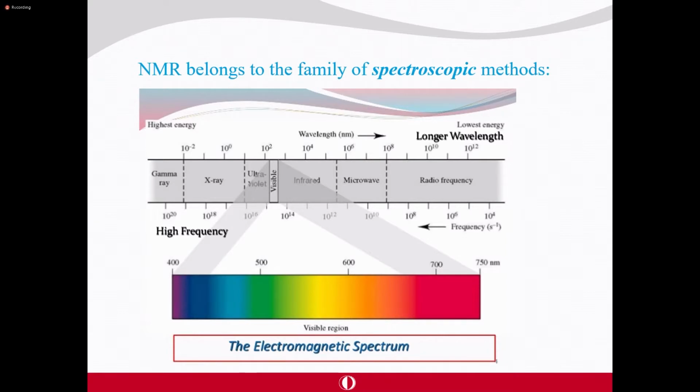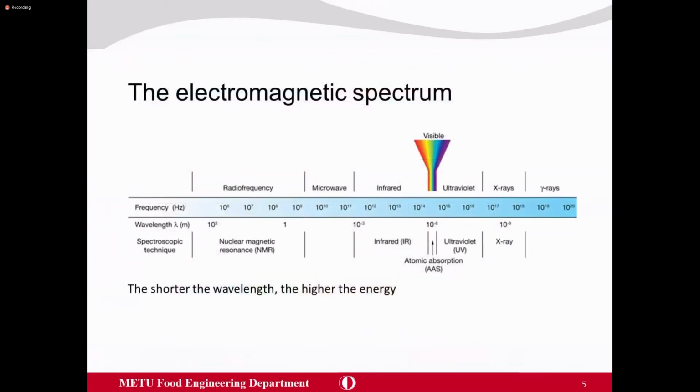In terms of nuclear magnetic resonance, we usually talk about the radio frequency range, as you see in the table.